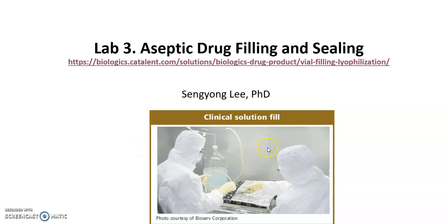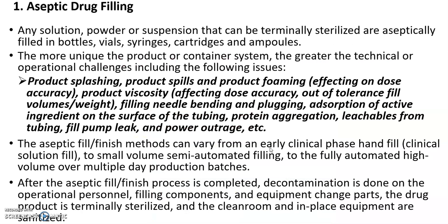So yeah, that's the lab you're going to do today. So aseptic drug filling again. A solution, powder or suspension, whatever will be filled in a primary container: bottles, vials, syringes, cartridges, or ampoules sometimes. So that's the filling process we're talking about.